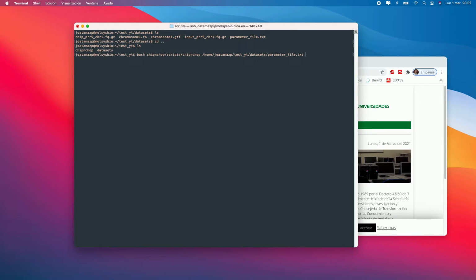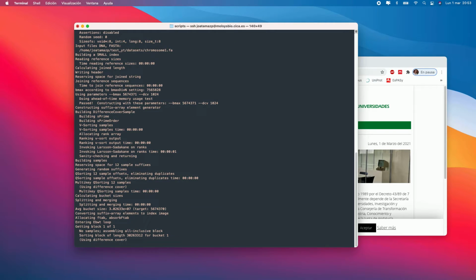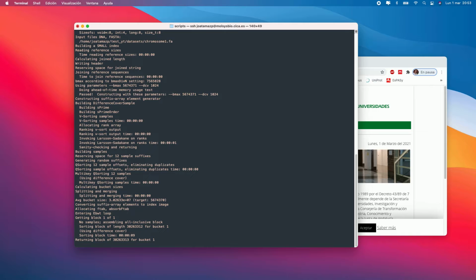If I was working with a transcription factor that does not span large regions of DNA but rather takes small portions of DNA, we would write this, transcription factor. If I was working with a histone or some epigenetic mark, I would prefer to use the histone parameter, which assumes that you're working with some sort of protein or protein modification that spans a large portion of DNA.